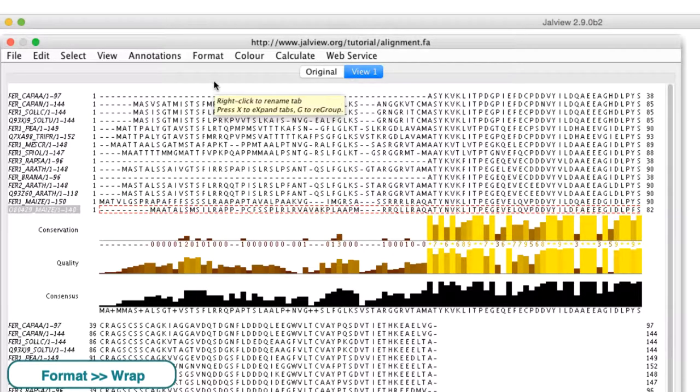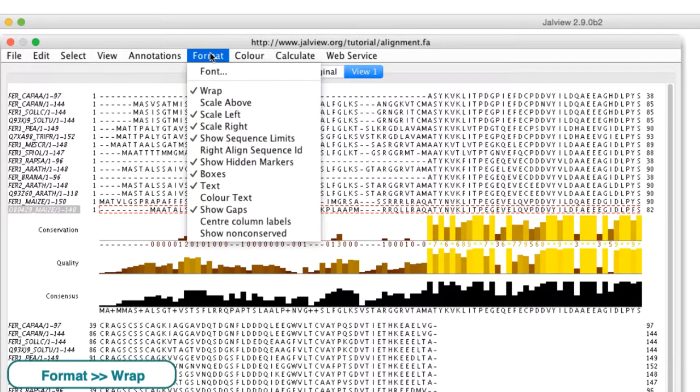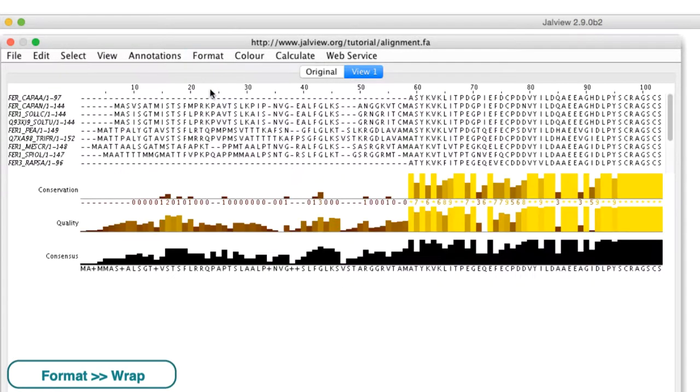A wrapped alignment is useful for publications and presentations but it is of limited use when working with large numbers of sequences.